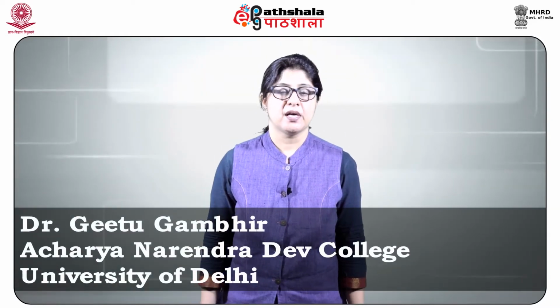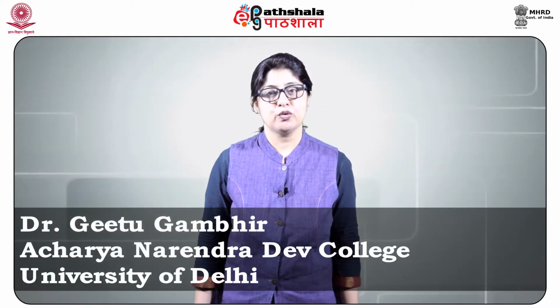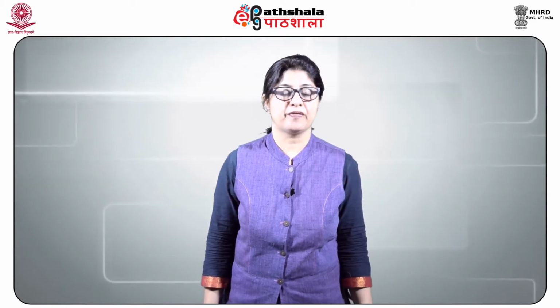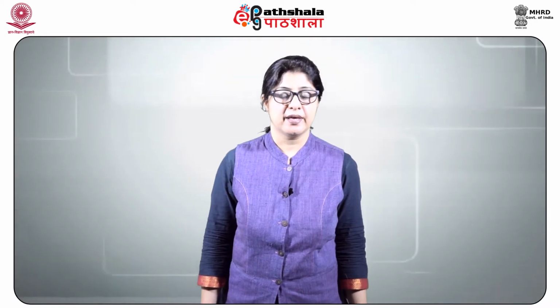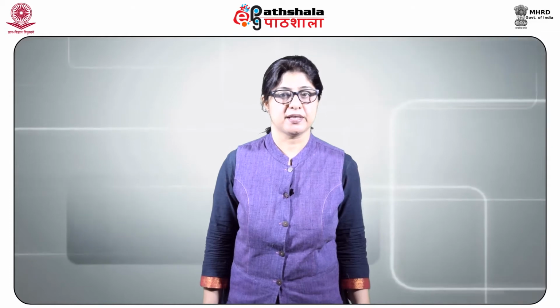Dear students, after studying this module, you shall be able to know about liquid chromatography and high performance liquid chromatography, the principles of HPLC, instrumentation and their working, and application of liquid chromatography and HPLC.